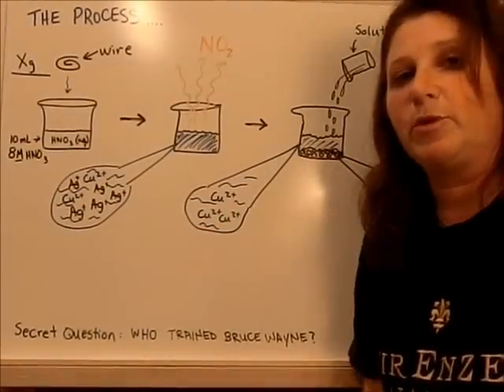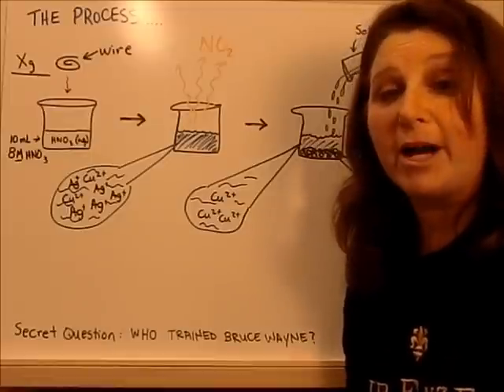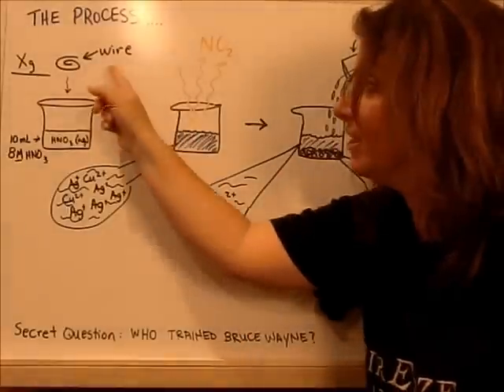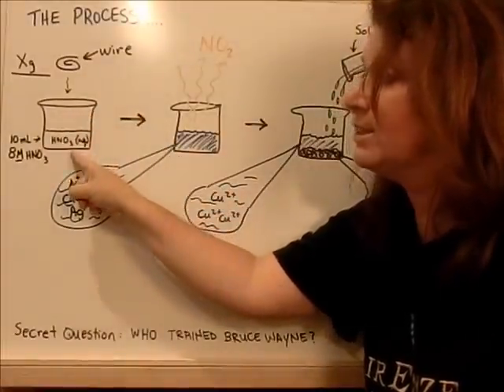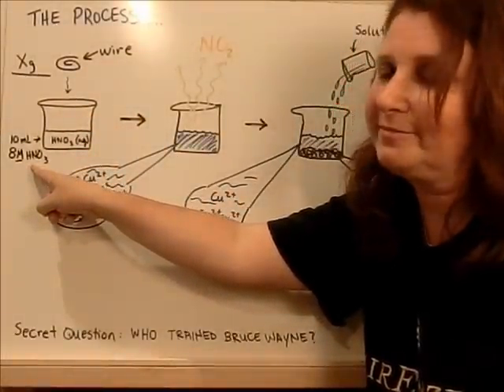So, what is the process that you're going to be using? It's actually pretty cool. You get to dissolve wire in acid. How cool is that? So here we go. You take your wire, you throw it into some 8 molar nitric acid, 10 mils of it.